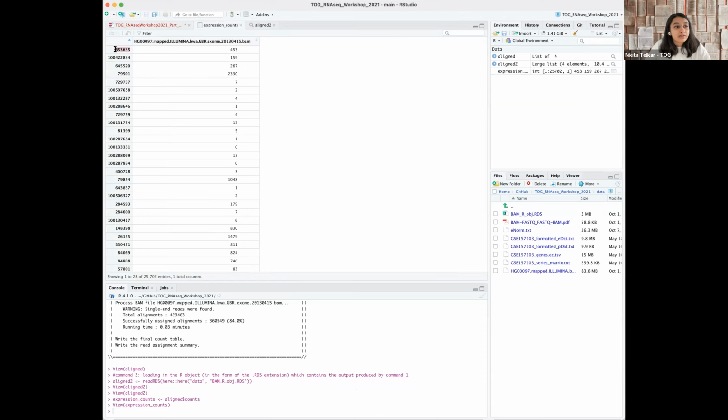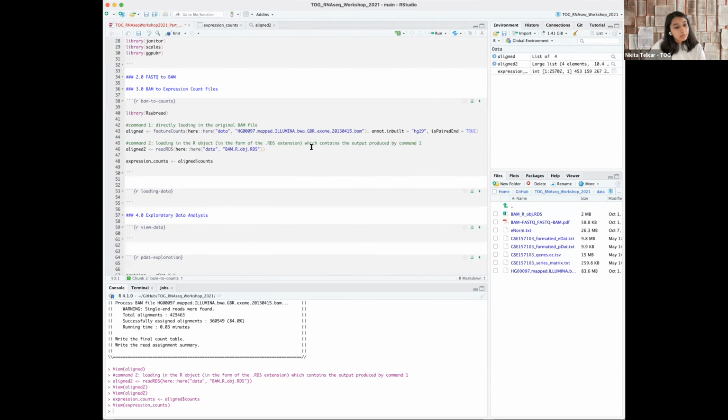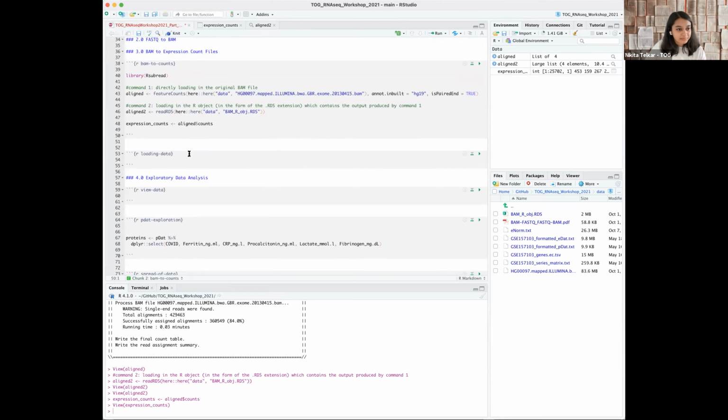Now these are Entrez IDs. This is something that will be required later on because sometimes people align to the HGNC gene symbol, and then sometimes it's to the Entrez IDs, but you need to figure that out as you go. But this is just one example of all the samples that you'll have to do. And now we'll start with our actual data.